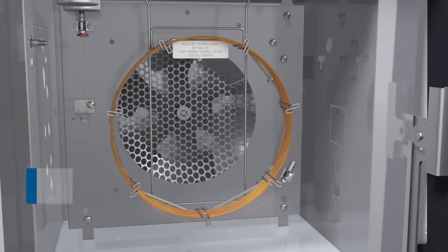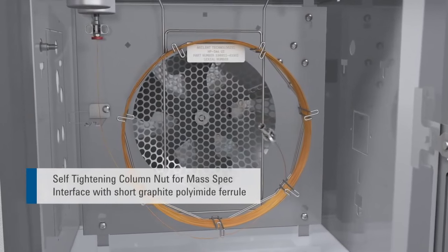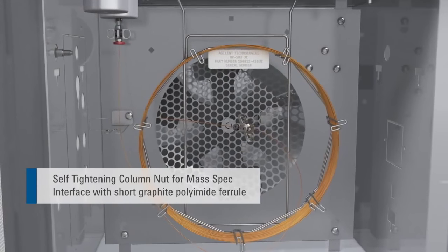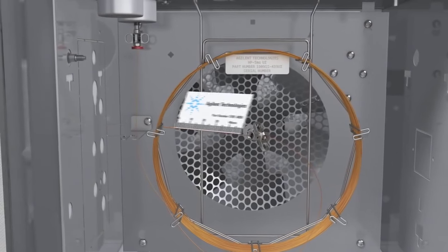The self-tightening nut is highly recommended for the Agilent mass spec transfer line. Finger-tight design prevents over-tightening damage. Be certain to have the correct length for the MS detector.